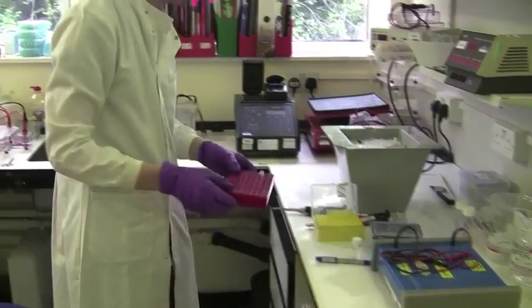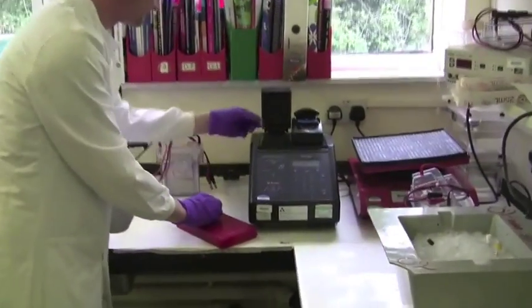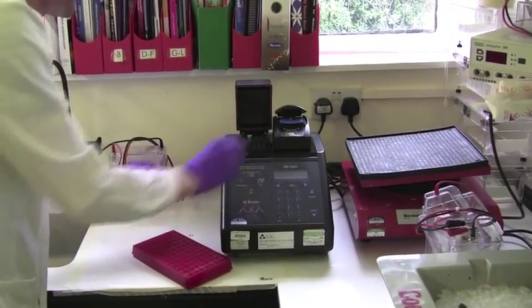To ensure denaturation of the proteins, the samples are then boiled at 100 degrees C for 5 minutes.